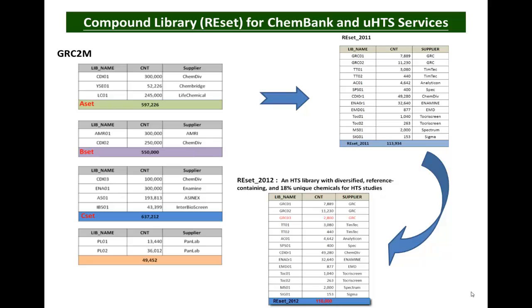So every year we make a significant effort to synthesize additional unique compounds and collect any additional compounds that we can purchase that are known drugs or APIs of approved drugs. We add these compounds to the existing library and also put them into the representative set. In 2011, we added about 4,000 compounds to the library, and also to the representative set.